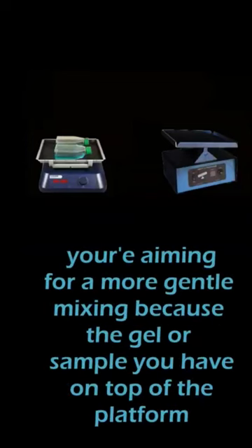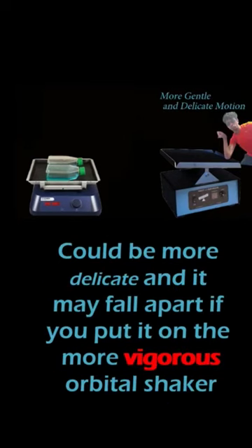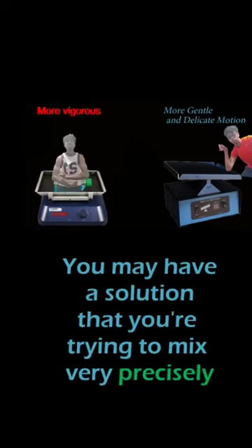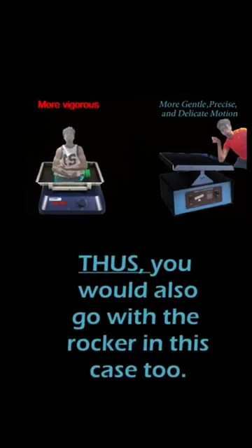You would use a laboratory rocker over a shaker if you're aiming for a more gentle mixing, because the gel or the sample that you have on top of the platform could be more delicate, and it may fall apart if you put it on the more vigorous orbital shaker. You may have a solution that you're trying to mix very precisely, and you don't want to make air bubbles in it. Thus, you would also go with the rocker in this case too.